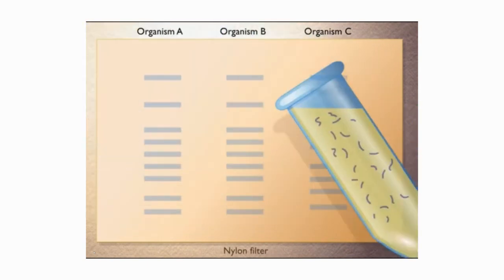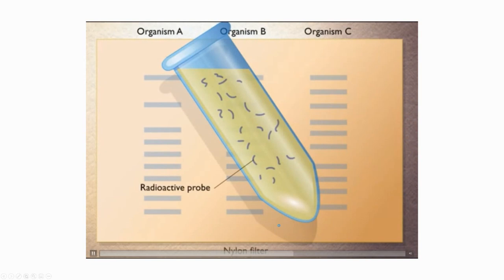Next, the radioactively labeled nucleic acid probe is added. So this is the probe. The probe is basically just the DNA that can hybridize with your target DNA sequence. And then the probe is labeled with the isotope or chemiluminescence, which we'll discuss later, because the binding of this probe to the target will give you the signal.